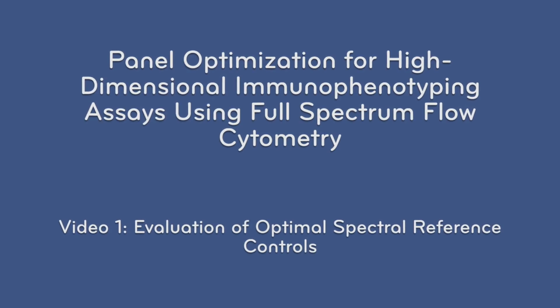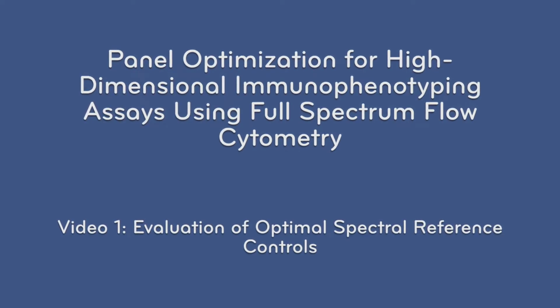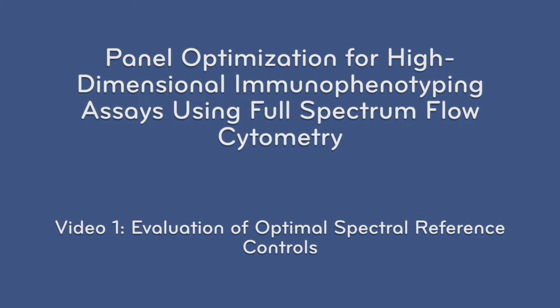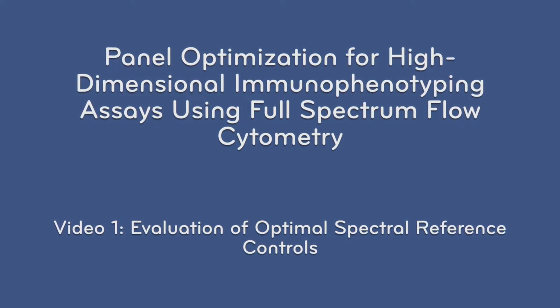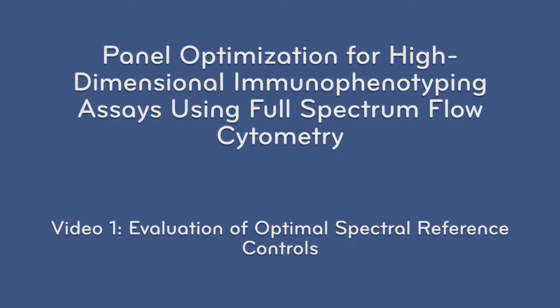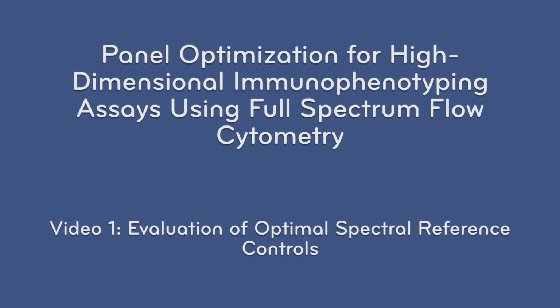This video is designed to accompany the protocol Panel Optimization for High-Dimensional Immunophenotyping Assays using Full Spectrum Flow Cytometry. This is video 1, which follows Basic Protocol 1, Preparation and Evaluation of Optimal Spectral Reference Controls.